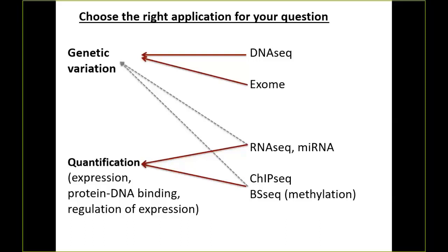And my answer to that is to come talk to me after class or send me an email, because the solution for this is the dual extraction, so getting both DNA and RNA very clean and basically sequencing quality DNA and RNA out of the same sample has come a pretty long way. There's definitely methods of doing this that will leave you a lot happier than trying to compromise on your sequencing method down the line.